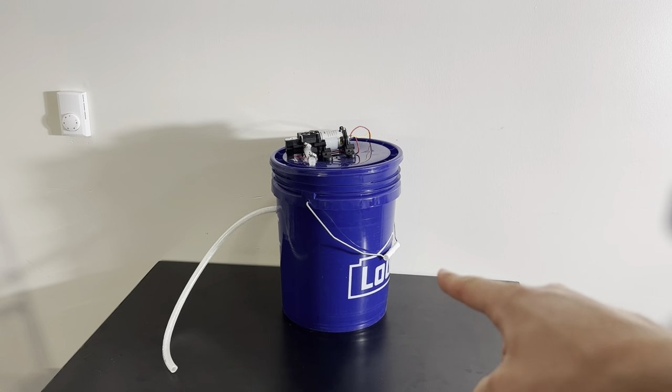In this video, I will share with you how I built this cheap vacuum pump for under $40, using a water aspirator and also a diaphragm pump, all of which I purchased for under $40.